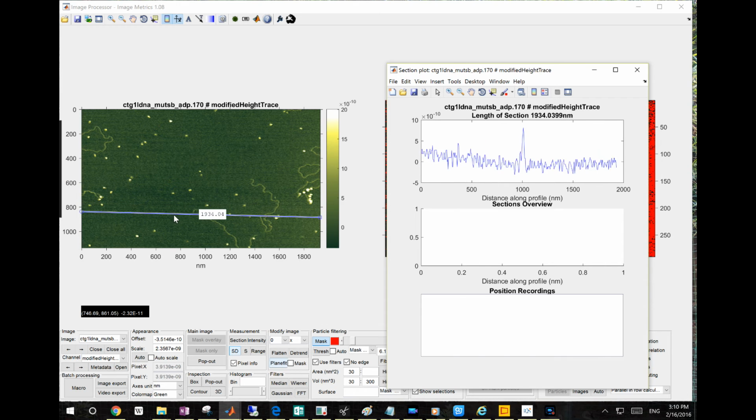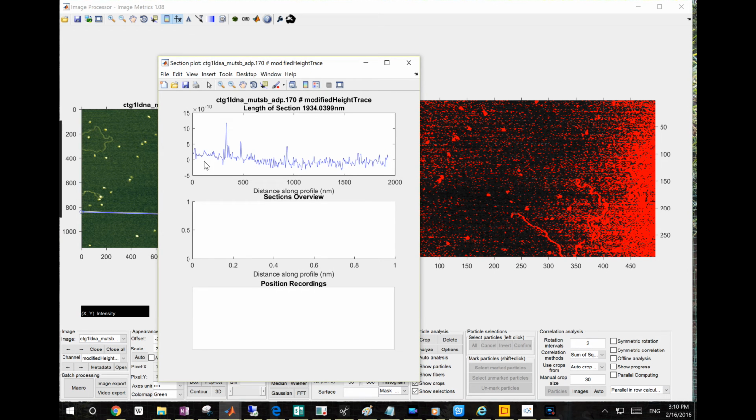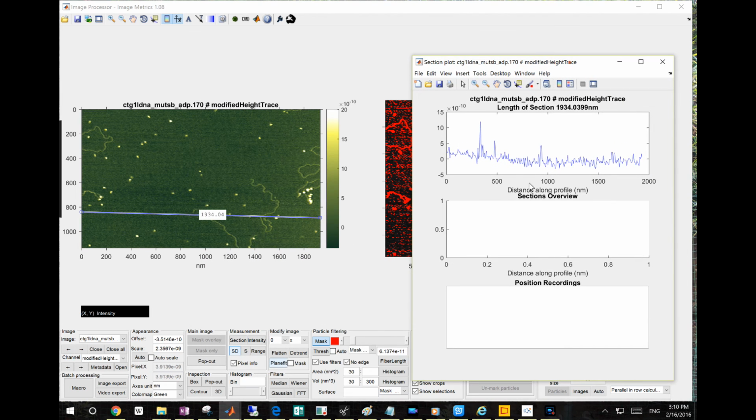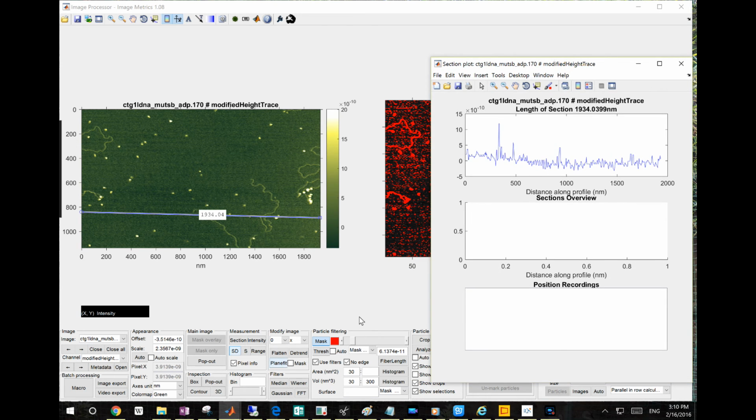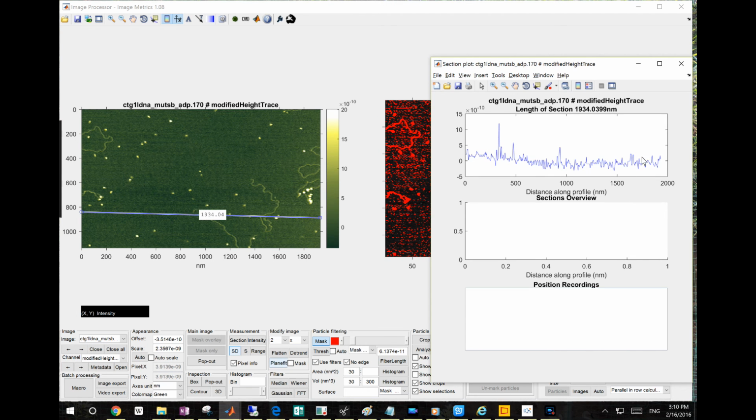So this line profile should be warped as well. You see here, the line is kind of warped in the center. And then you can do a detrend function, which basically only fixes this specific line. It's not fixing the image, but it's trying to fix the line plot, the section line here. You can also do a mask detrend as well. But here I just use a second order x direction detrend. So I check the result. Right now you see it's warped, right? Let's click detrend. Now you see it's pretty flat, so it's fixed the nonlinear trend here.